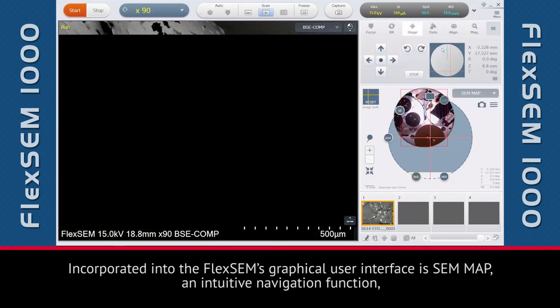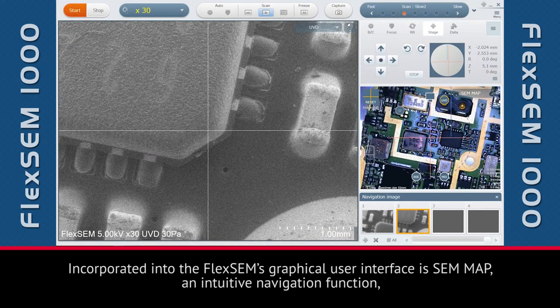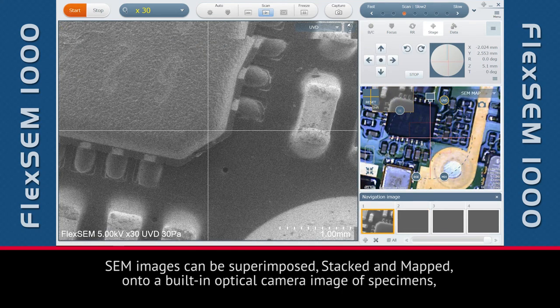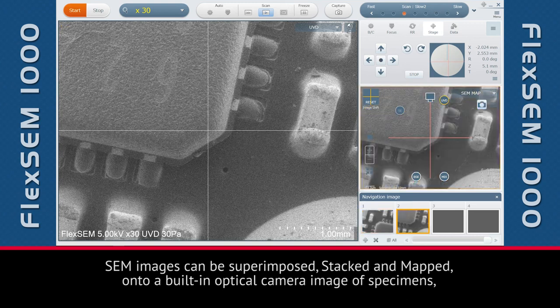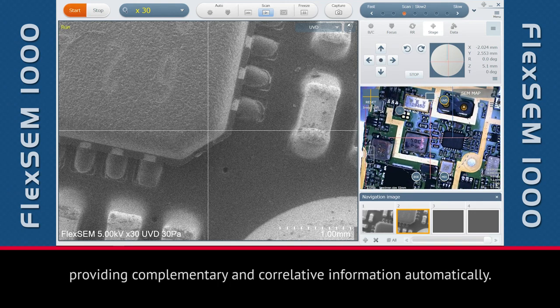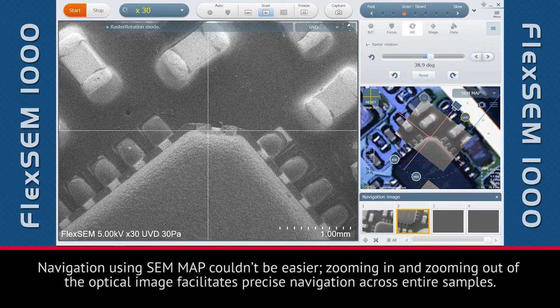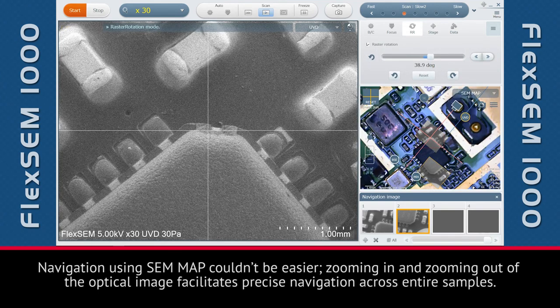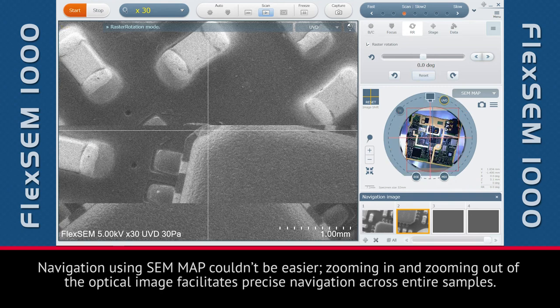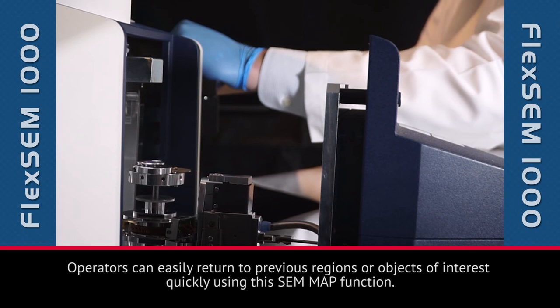Incorporated into the FlexSim's graphical user interface is SemMap, an intuitive navigation function which enables the operator to correlate optical and electron images on the fly. SEM images can be superimposed, stacked, and mapped onto a built-in optical camera image of specimens, providing complementary and correlative information automatically. Zooming in and out of the optical image facilitates precise navigation across entire samples, and operators can easily return to previous regions or objects of interest quickly using the SemMap function.